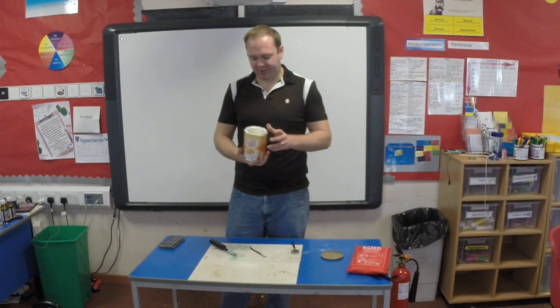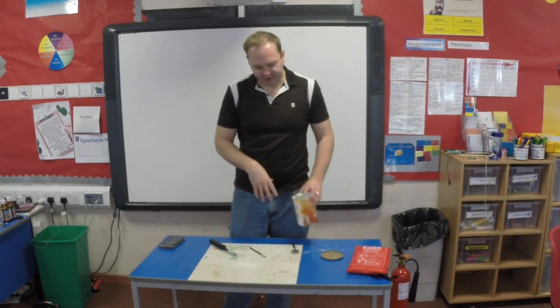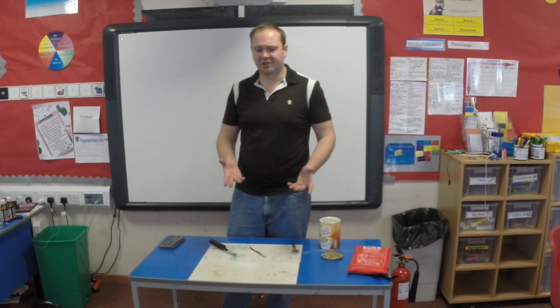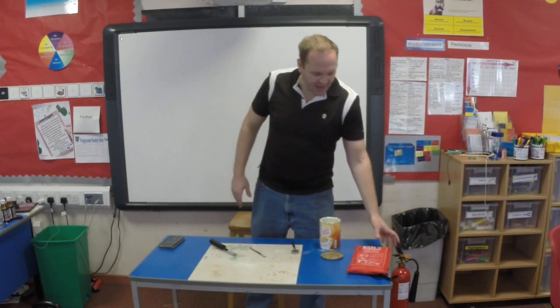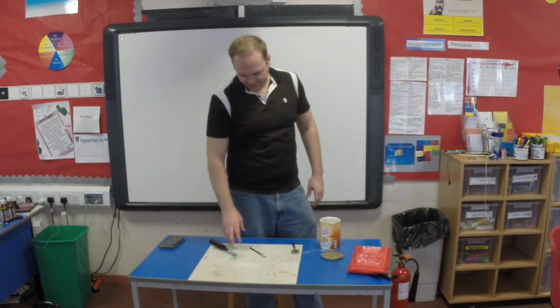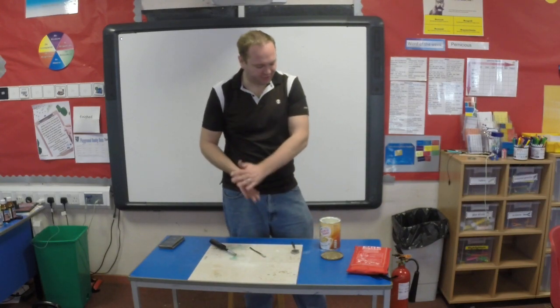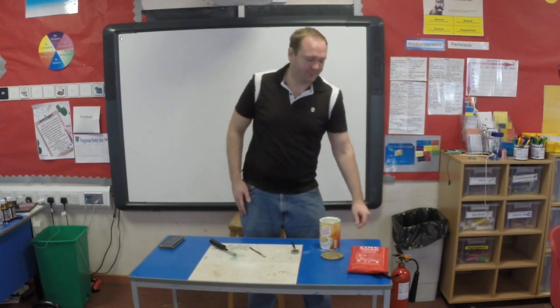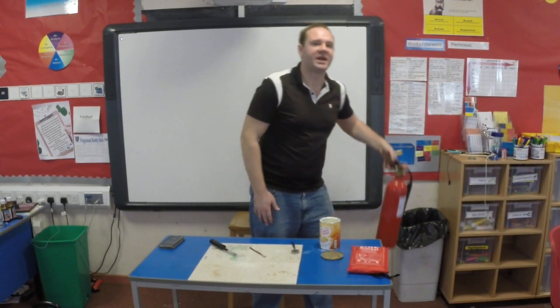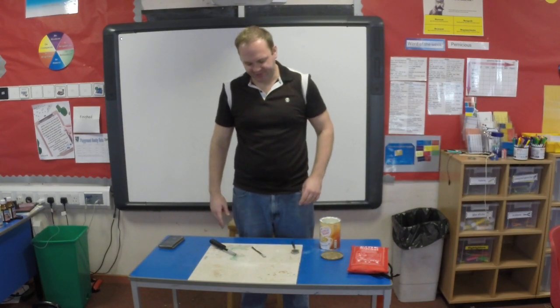So the particular mix of chemicals that I'm using in this case is a store-bought coffee creamer that is in fact highly flammable, though it doesn't say it on the box. Now, because we're doing ultimately a combustion reaction, a flammability reaction, you want to take a couple of safety precautions. So you would like a couple of heat-proof mats just to do this over, a fire blanket, and a fire extinguisher on standby just in case. However, very low risk and it's perfectly safe to do.